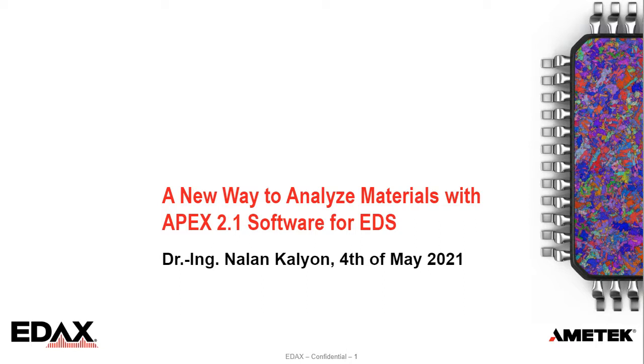Thank you, Jonathan, for the kind introduction, and thank you all for attending the webinar where I will show you a new way to analyze materials with the APEX 2.1 EDS software.